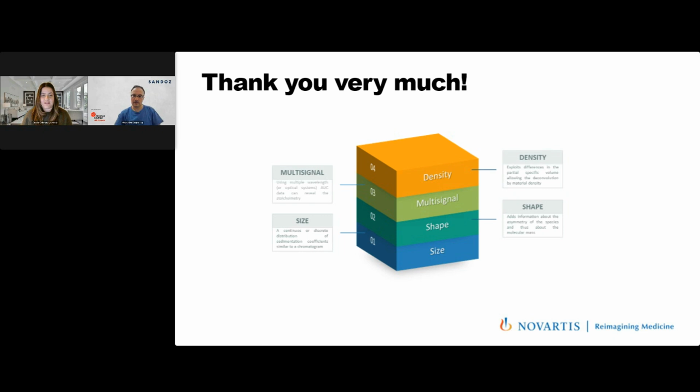Wonderful. Thank you. Our next question says, the LNP characterization is exciting. Thank you for showing the data. How important is AUC in your organization for LNP characterization, and which other methods do you use for the characterization of LNPs? What I can still say, because I'm not part of Novartis anymore, is the cell and gene department has, I would say, 90% of the centrifuges which Novartis owns. So it's really an important tool for that. But yeah, I'm not Novartis anymore. I wouldn't talk too much about what other methods they are using.